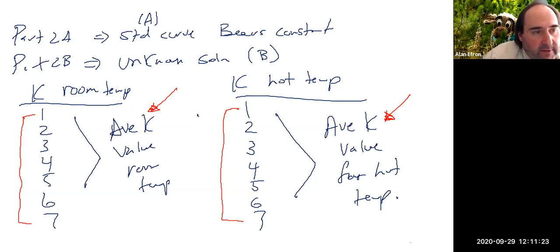And if you're not going to use the Pasco file for that, then you have two separate Excel files that you could use and do the same sort of analysis in Excel. Any other questions on that?